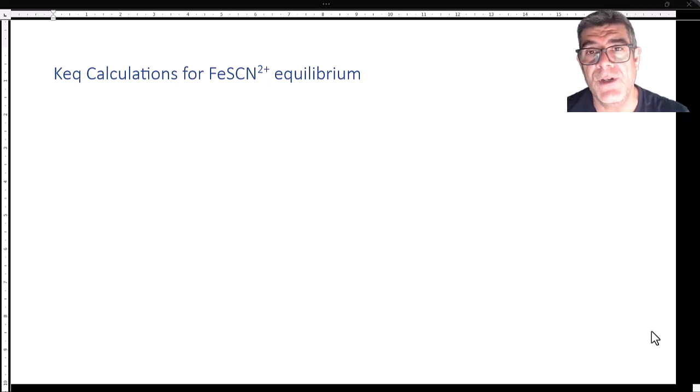The most important thing, of course, is repetition. And even with the last step, I only carried that out once. It's obviously a good idea to carry it out a couple of times. Reflecting on this particular experiment, one of the things that I would do differently next time is I would definitely change my initial concentrations. I think I needed to have a smaller concentration, a 0.001 concentration of my potassium thiocyanate to begin with, in order to construct my calibration curve in the first place.